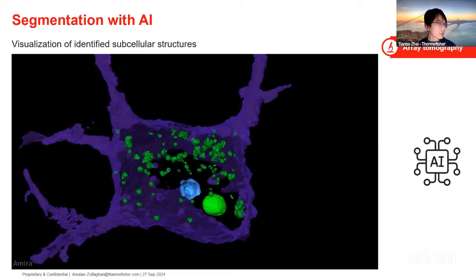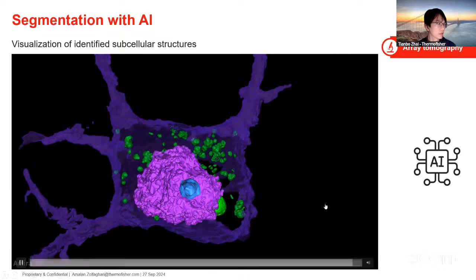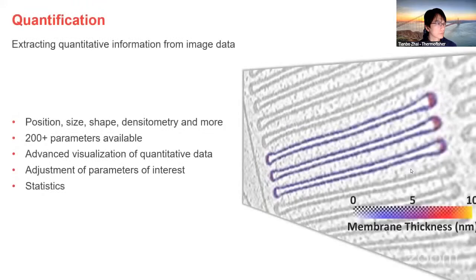And when those groups cluster together, you will see a certain structure of interest, and they are noted by different colors here. So as we went through the segmentation process, many methods can help us get to that structure of interest.